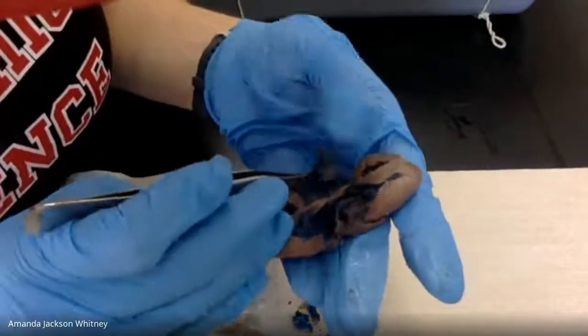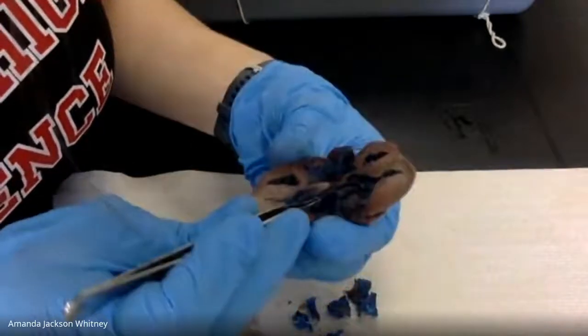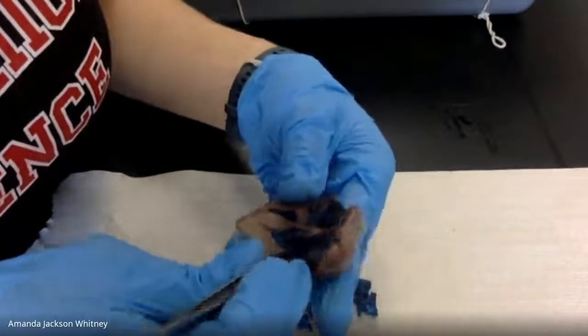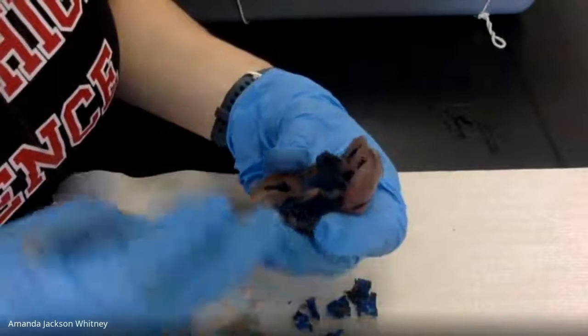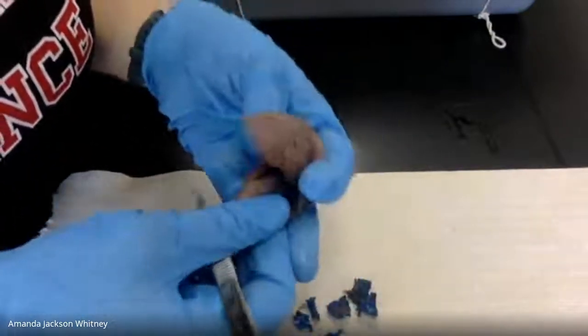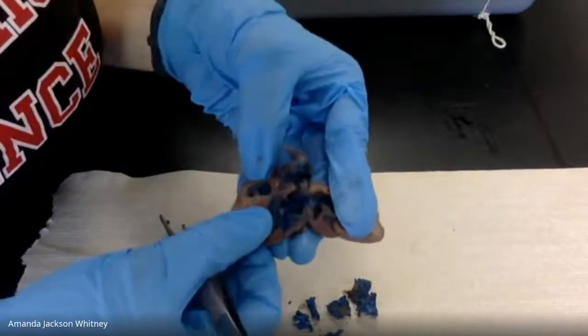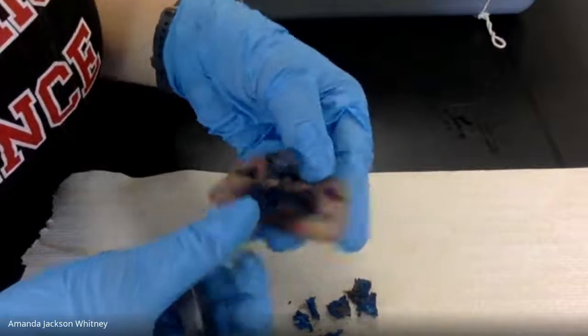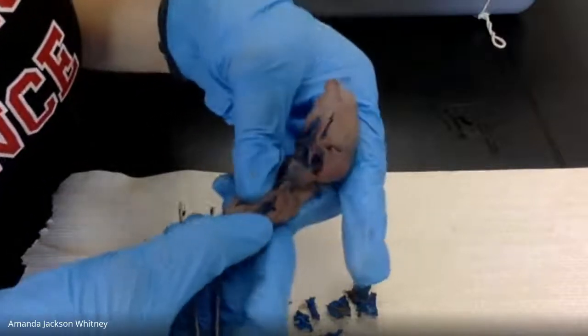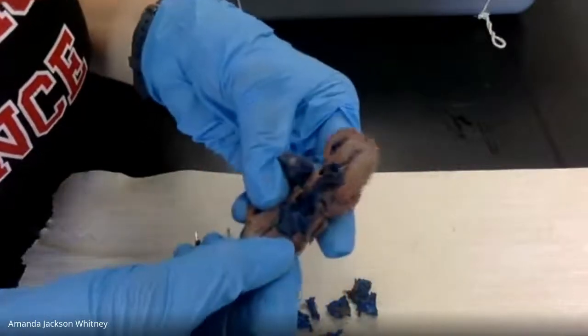Usually it's a little bit easier to just pull the latex out, it just kind of pops out, but this one is really bad. I have some much better pictures from my last quarter class, so I'll probably share some of those with you guys. That being said, there are still a few things that we can see in here in terms of valves. There we go.